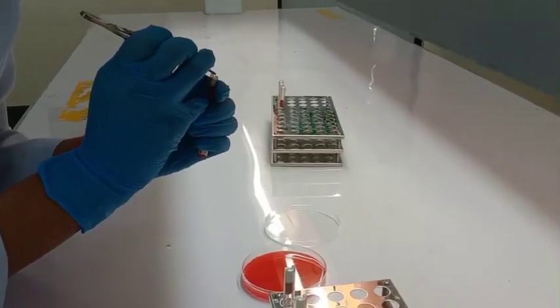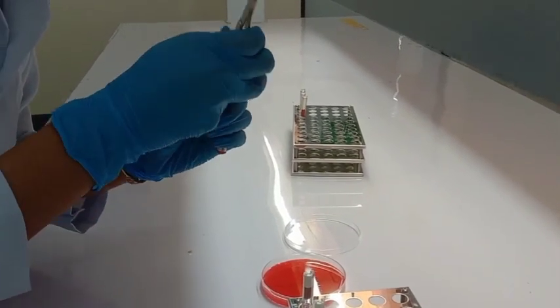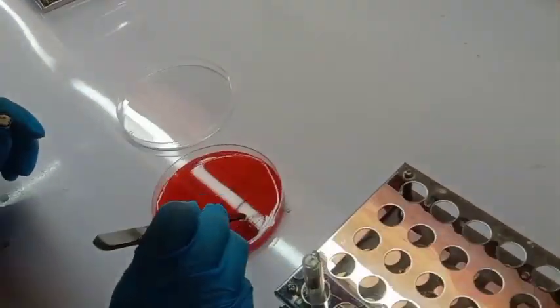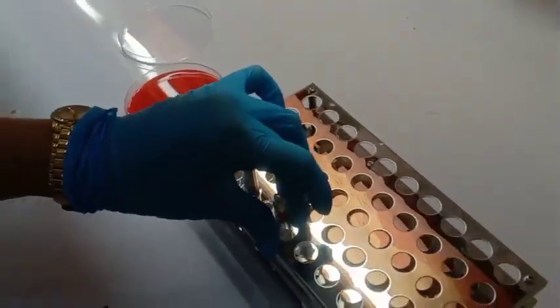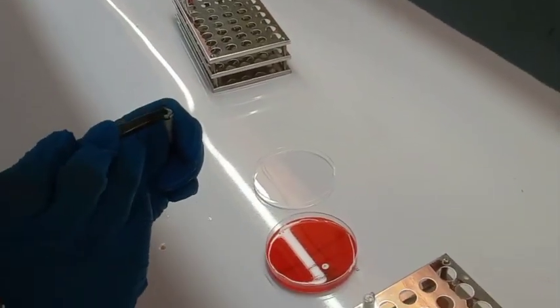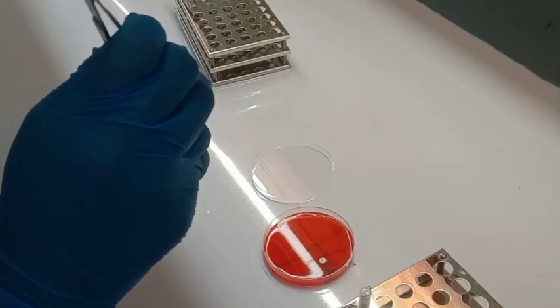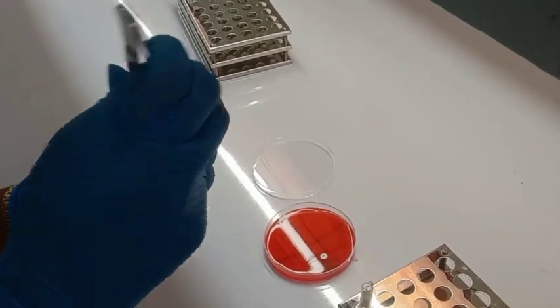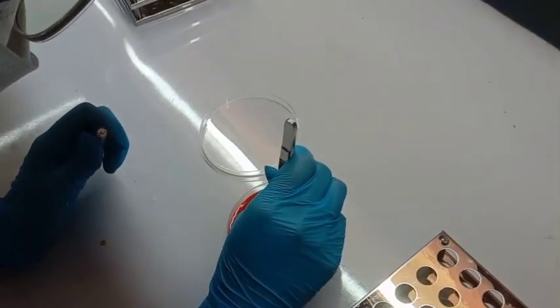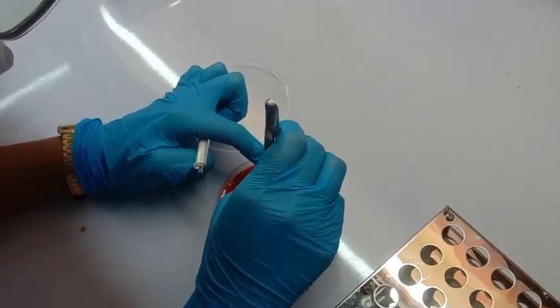Taking the first antibiotic, which is the 5 microgram novobiocin, we are going to place the novobiocin onto the area of the plate where the Staphylococcus organism was streaked. And then we are going to take the bacitracin disc and place it on the area of the plate where the Streptococcus was streaked.